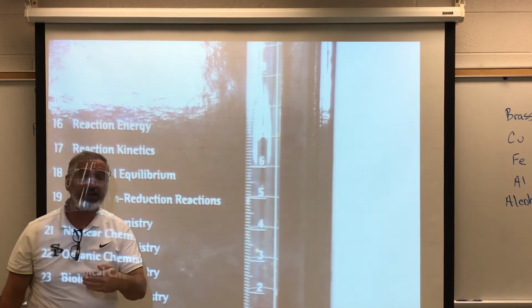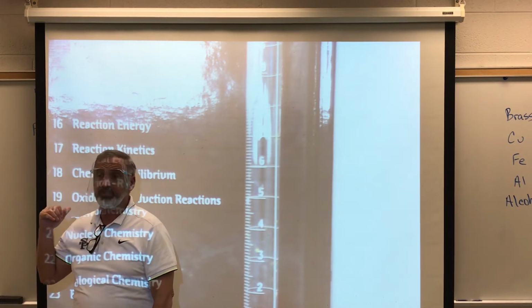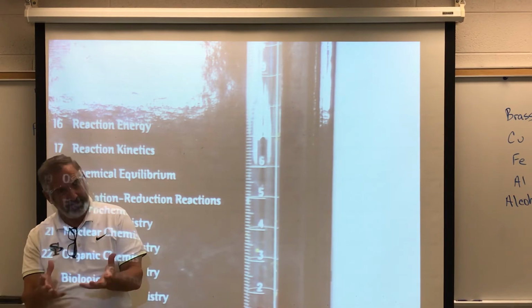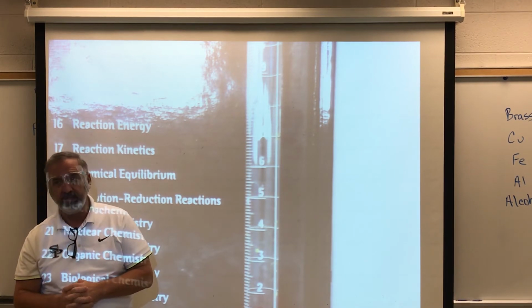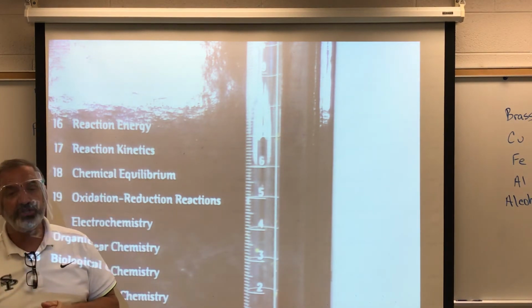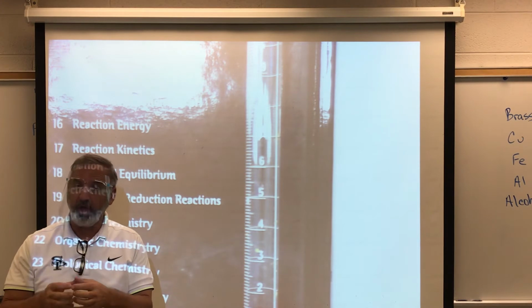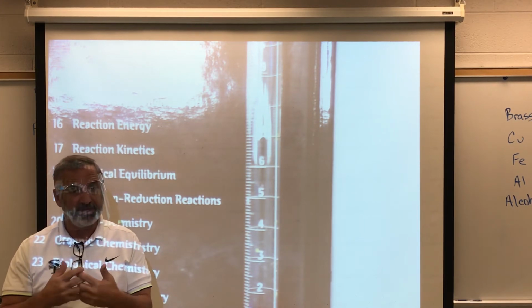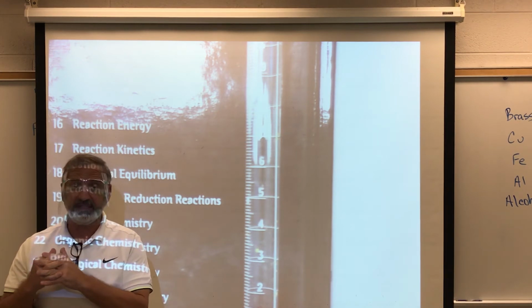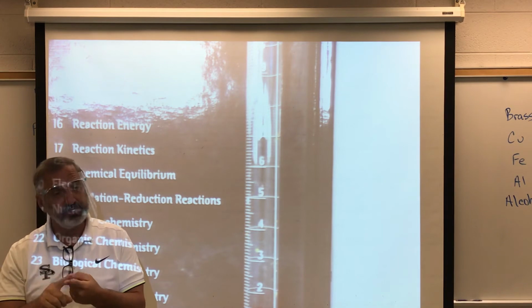You don't have to have exactly 12 grams of the potassium oxalate monohydrate, you just need to know exactly how much you have. Okay, just about 12. All right? Now, lastly, when you're going in here, you're going to have to heat up the water. You're going to put it in 20 milliliters of water. You're going to have to heat up the water to get the potassium oxalate to dissolve. You're going to heat it, you have a thermometer, you're going to heat it to about 80 degrees.